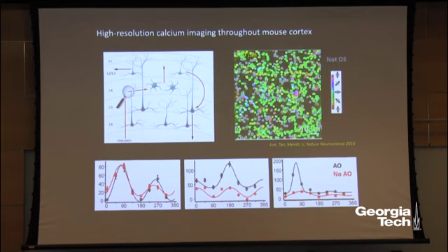But for many more boutons, the difference is much more drastic. Without using adaptive optics, you would think that those boutons are not really tuned. But once you use adaptive optics, the tuning curve becomes much sharper, and you can say unambiguously that those are the tuned inputs.